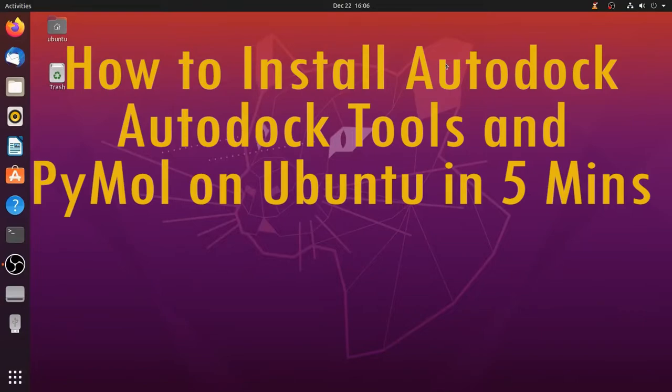Welcome everyone, today we are going to see how to install Autodock, Autodock Tools and PyMOL on Linux, specifically on Ubuntu.